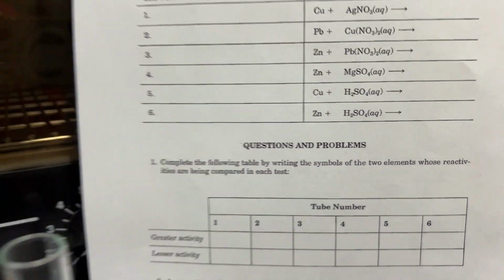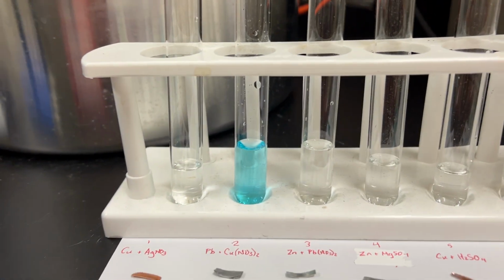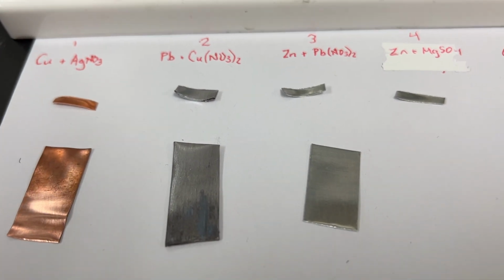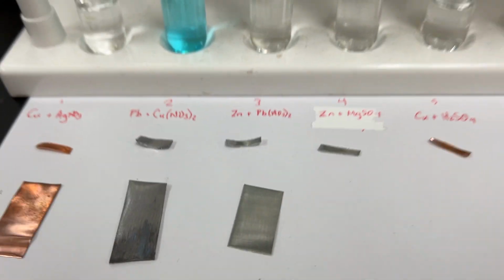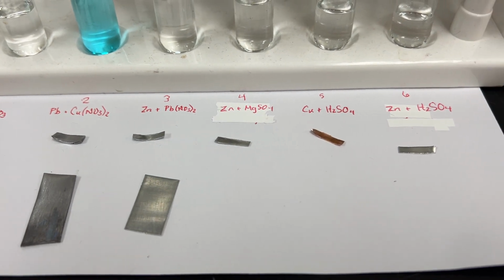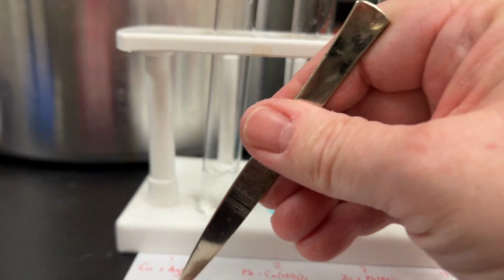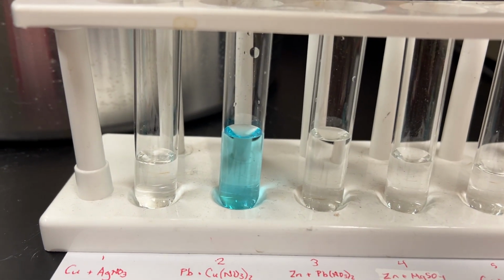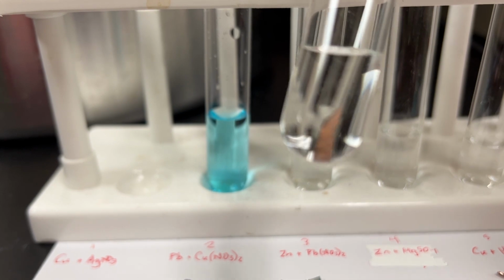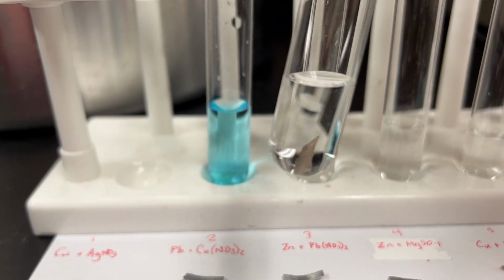So I have some test tubes set up here, and if you just take a look at the metals first, copper is an orange shiny color, lead is kind of a bluish gray, zinc is a shiny metal, and then we have the zinc and the copper and the zinc again. So I'm going to place each of these in a test tube. This is probably not the best quality. I'm trying to find the best view of this.